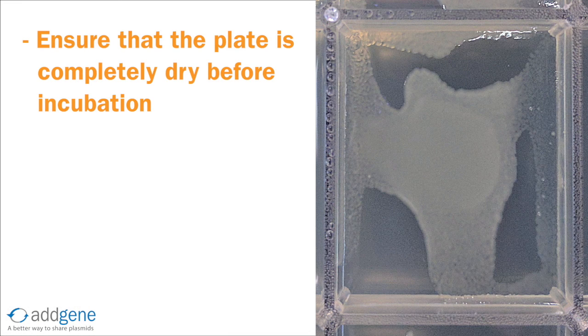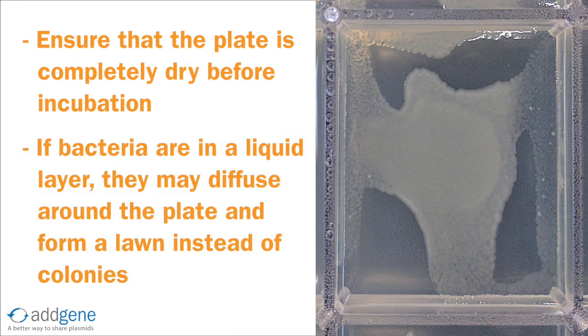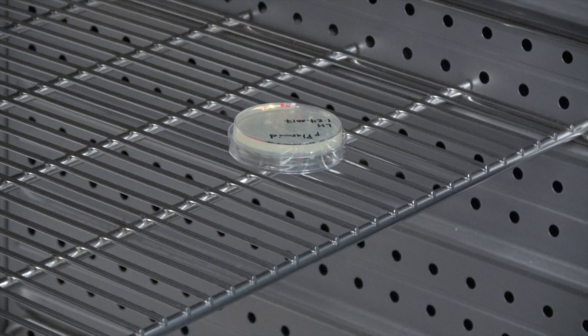Be sure that the plate is completely dry before incubation. If the bacteria are in a liquid layer above the agar, they'll diffuse around the plate and the daughter cells will form a lawn instead of a colony. Remember to place the plate upside down so that condensation doesn't drip onto the colonies and disturb them.